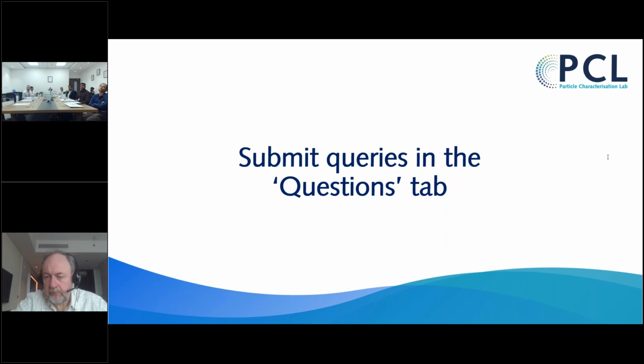Thank you, Darren. There is another question here. So what is the correlation between surface energy and mass flow? Mass flow. So we're guessing they mean powder flow. Yeah.